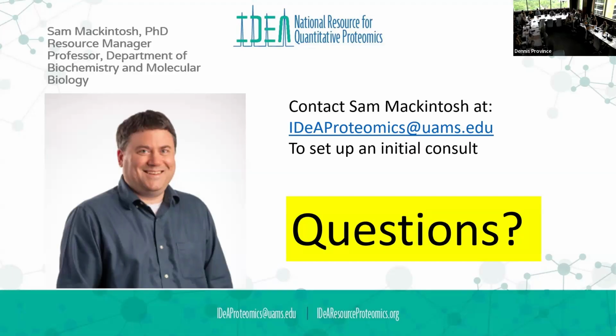And the second question: for quantitative proteomics, is spectral counting something to use instead of TMT? Spectral counting would be, if we just did a DDA experiment, the question is how do you quantify that peak? Do you quantify it at an MS1 or an MS2 level? Back in the day, people would just count how many times they see this particular m/z, and that's the counting measurement.